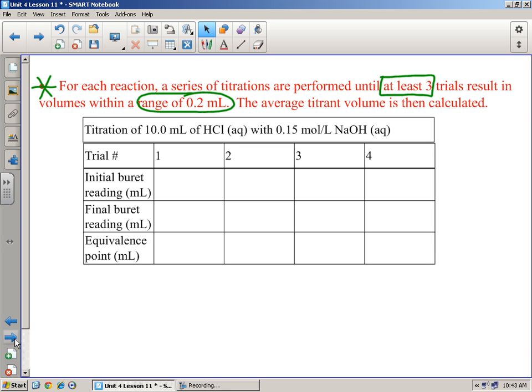It's got a valve at the bottom. If it's in line like it is right now, it's open, so anything in here will drain out. To close it, you will turn it horizontally, of course. This valve goes both ways, so open, closed, open, closed. Either way you want to turn it, doesn't matter.